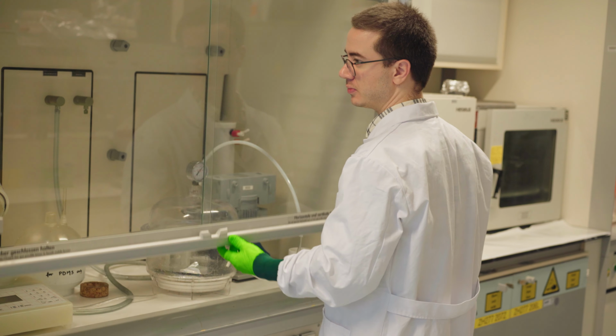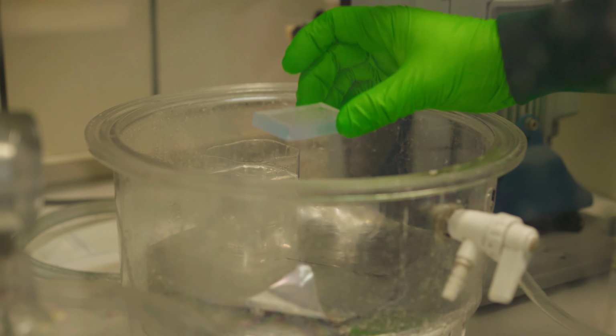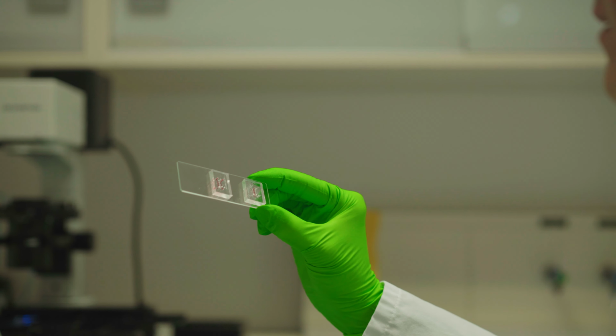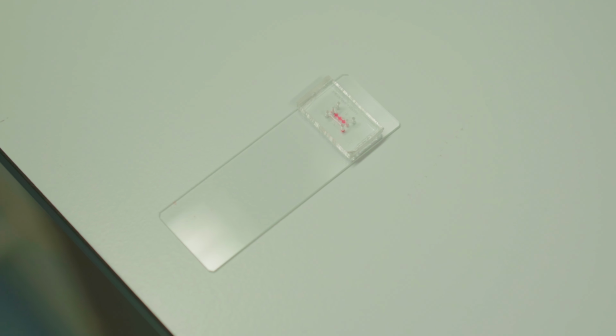So the core technology that we are using to build our model is an organ on a chip. What we do is create a miniaturized version of a tissue of an organ in such a device. And in such a device, which is a chip, we have very small structures which are comparable in size to the dimensions of a human hair, and we can create different types of chambers and pipes in which we can introduce liquids but also the cells.